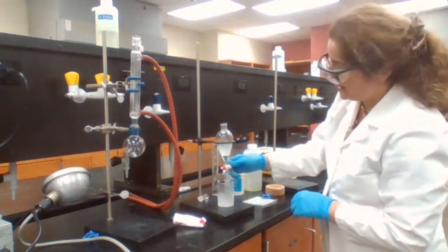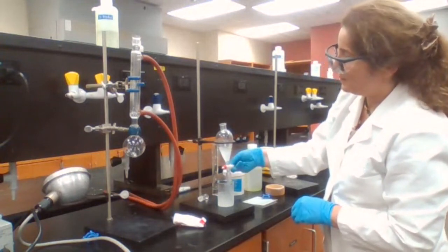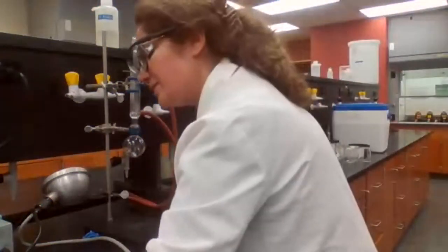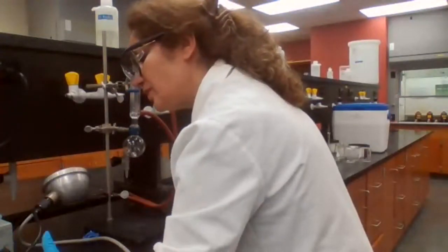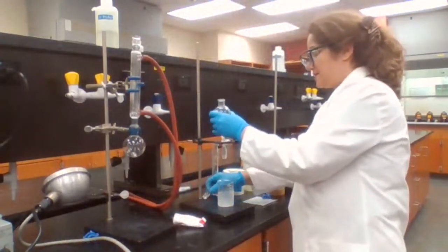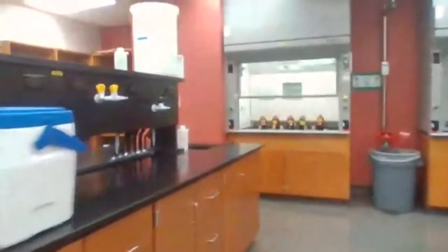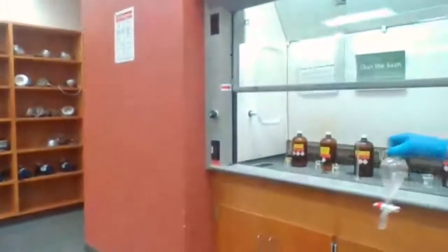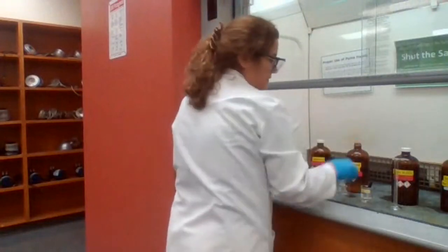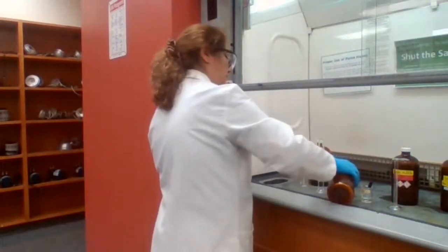What's the next solution that I'm supposed to add? Next one, sodium bicarbonate, and how much? 25. Sodium bicarbonate, 25. Okay, let's move to the fume hood and get 25 milliliters of the saturated sodium bicarbonate.